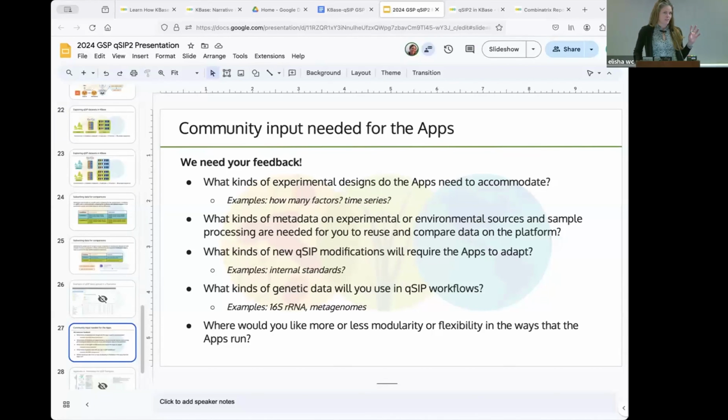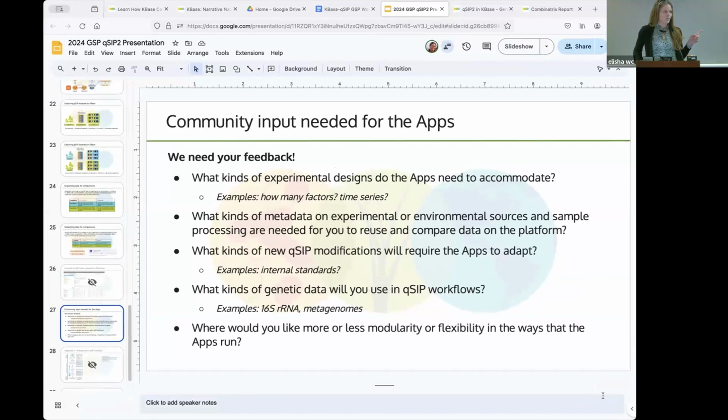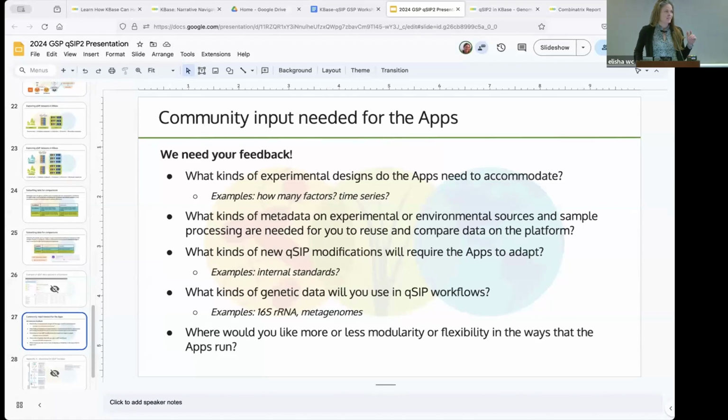The challenge is there's a lot of variables, as you see, when Jeff is building out the user interface for what comparisons you want to make, how to identify those. And so what we're looking for as people get comfortable and start to use qSIP more is to understand what that user experience in that drop-down menu needs to look like to make it intuitive.